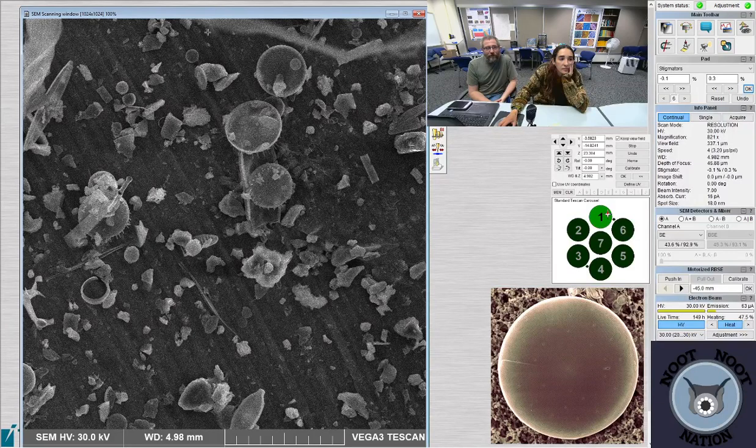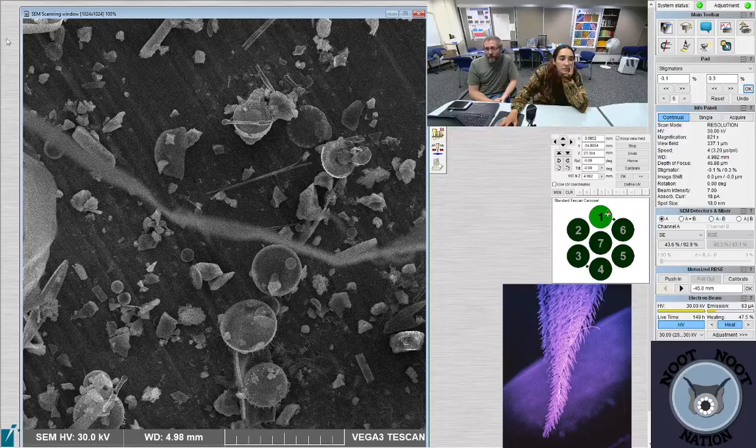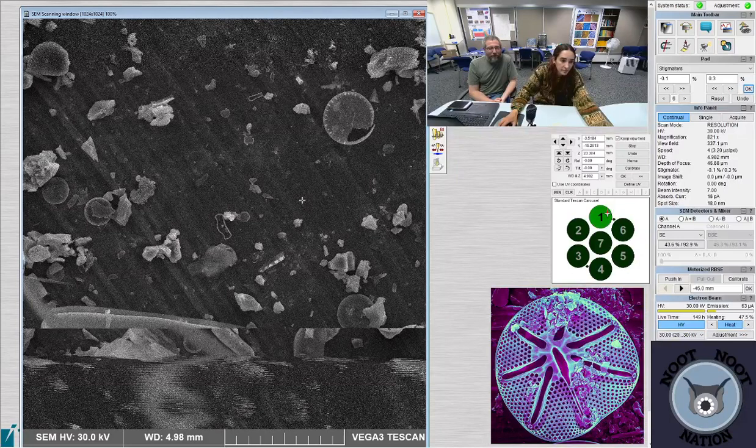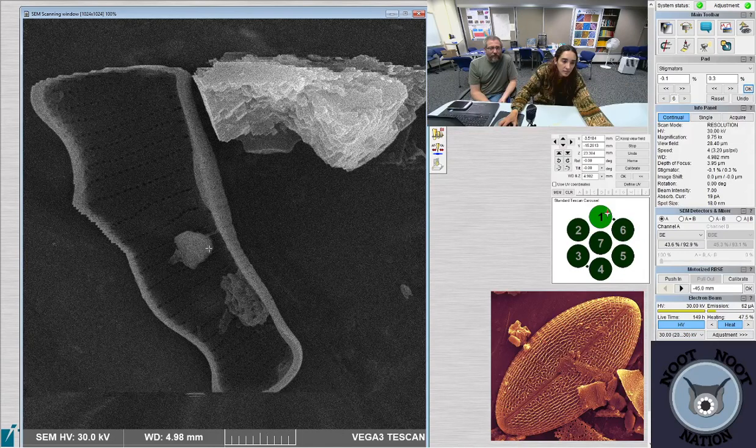If you were to take samples that you wanted analyzed to an SEM lab, very likely they would charge you anywhere from $50 an hour to $120 an hour to use the instrument. We've been streaming for 2.5 hours. We've racked up $125 of charges if we were on somebody else's instrument. But because it's my lab and my instrument and I know how to run it, really all we're using is a little bit of the supplies.